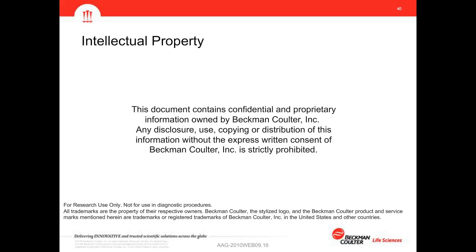Sure. I think, again, a lot of it goes back to what Tim's been describing. I think just freeing you up from having to worry about the data aspects during the actual screening itself. As Tim mentioned, we did have an initial CSV file that came from Sigma, and that was the last time I dealt with Excel until I had all of my information at the end of the screen.